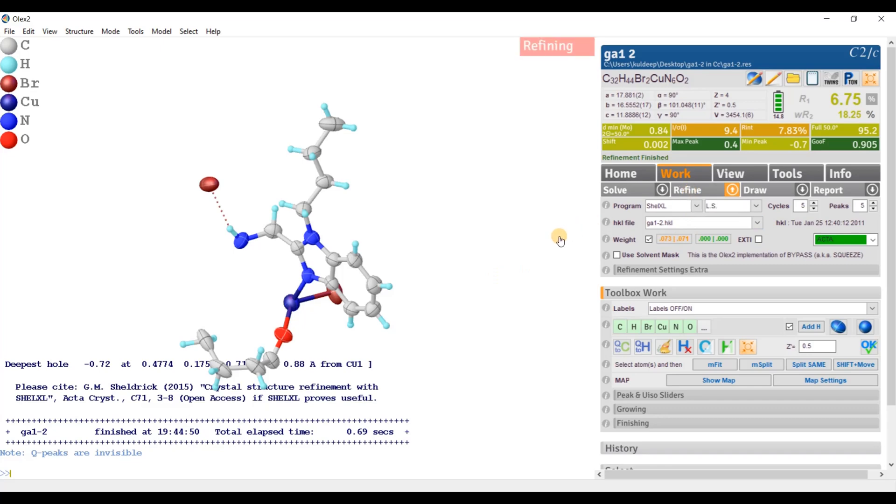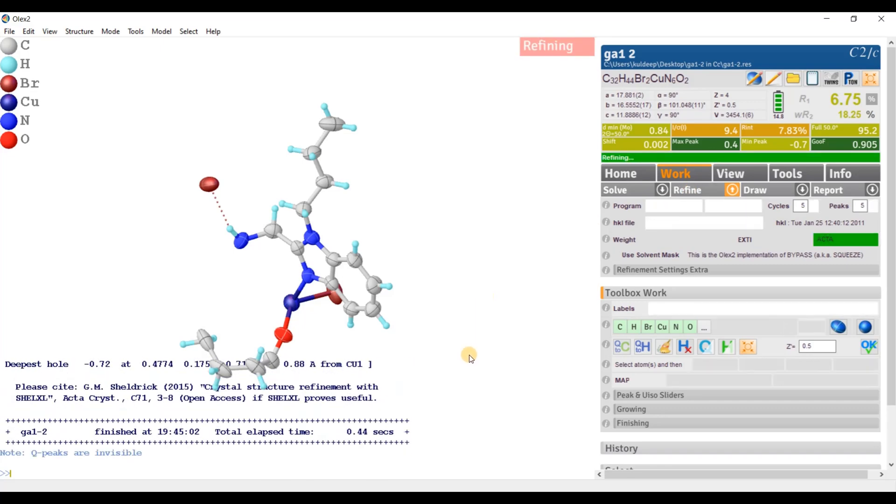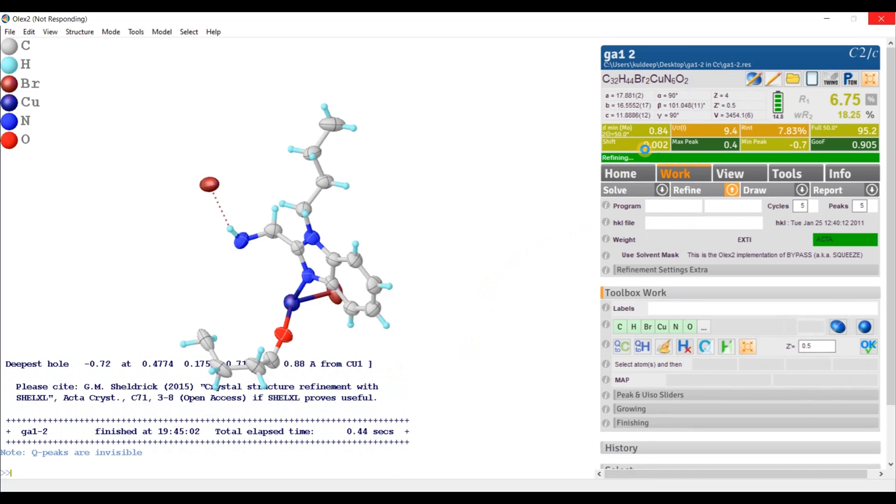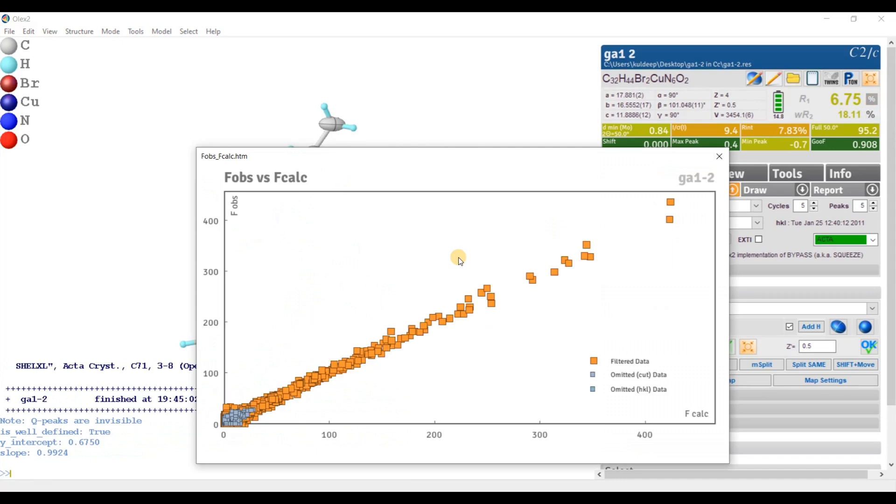Refine one more time. Okay. So shift is now almost zero, it's zero. And F observed versus F calculated graph is looking nice.